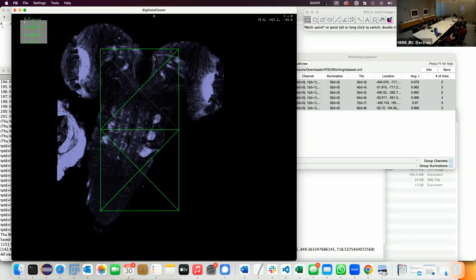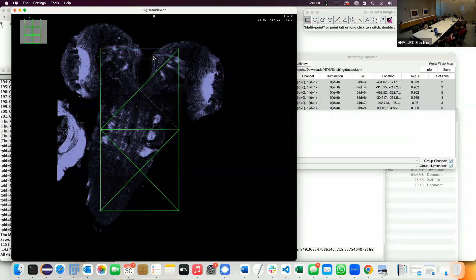If you insist on using the highest resolution, reduce the parallelism — say only do four at a time. Because if you do 64 or 128 at the same time, it loads 128 images at full resolution simultaneously, then does Fourier transforms on them. That could run out of memory. But again, don't do it at full resolution — there are no advantages.